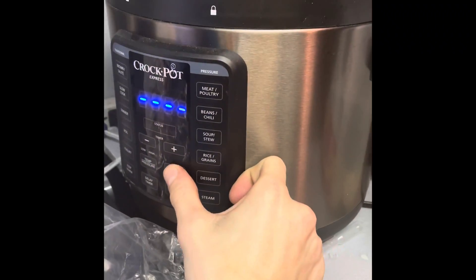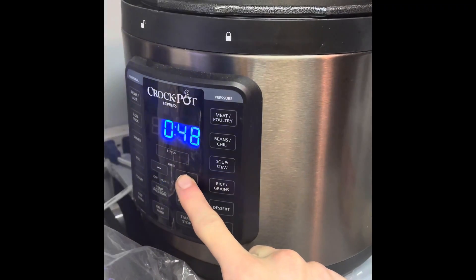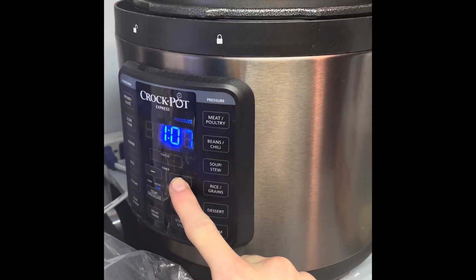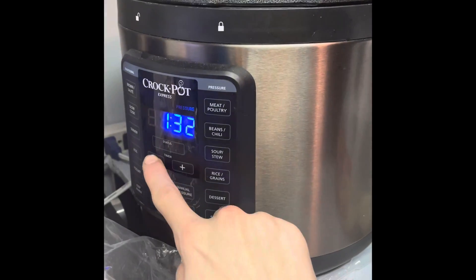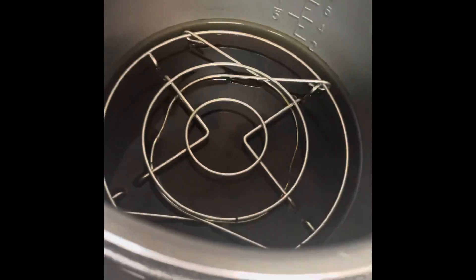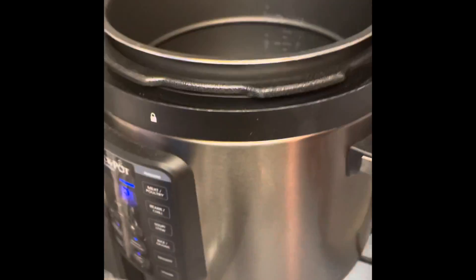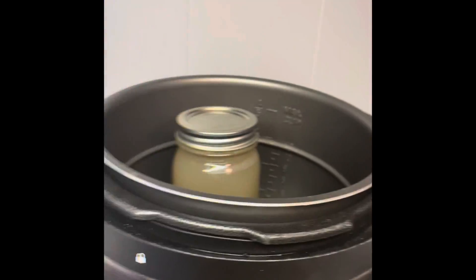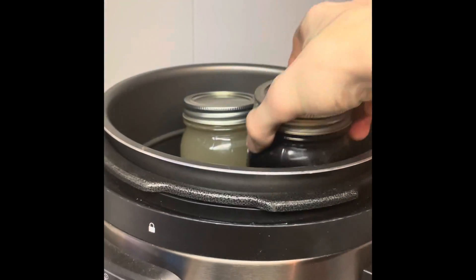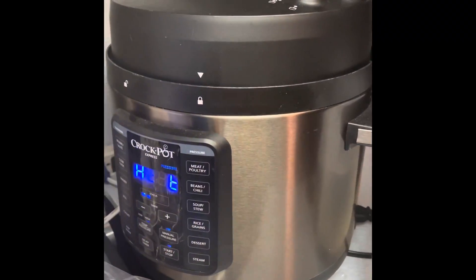To sterilize the agar, put it in your pressure cooker set to an hour and 30 minutes to two hours at high pressure. Place that metal trivet in the bottom and fill it with water until it reaches the brim of the trivet. This is so that steam can sterilize the jars — you want to steam sterilize it, not have the jar touching the bottom of your pressure cooker.